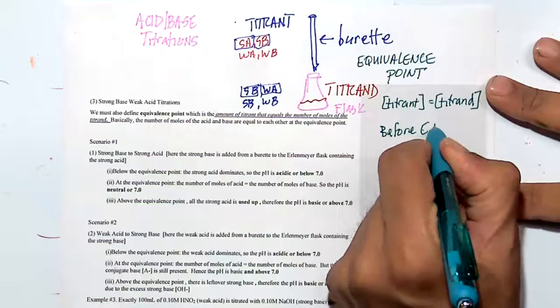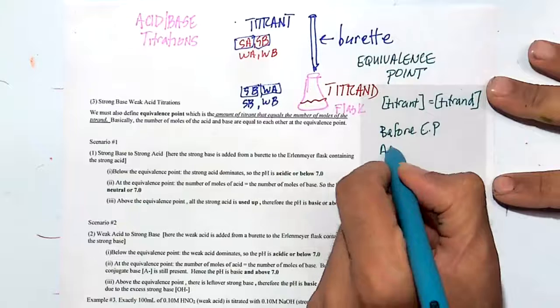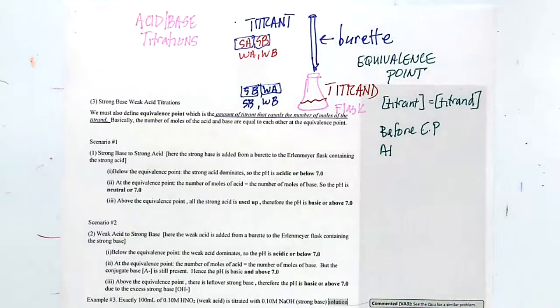I'll call it EP, the equivalence point. That is when it turns just pink and doesn't go away, just pink, okay? Slight pink. That's what I tell students, the slightest bit of pink. And most of the students will just get it to this color. Oh, done. No, the slightest bit of pink.